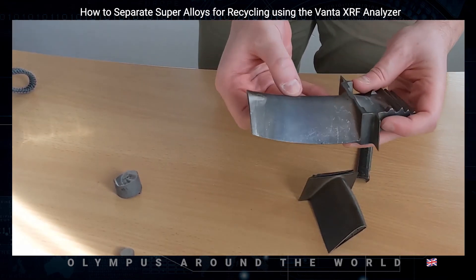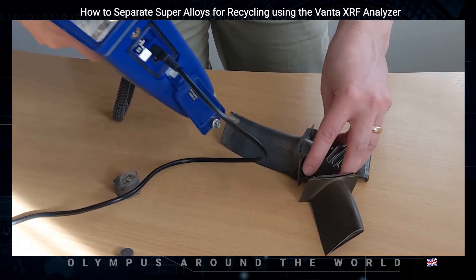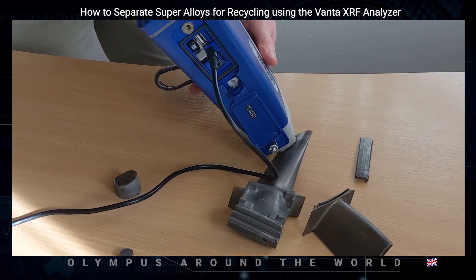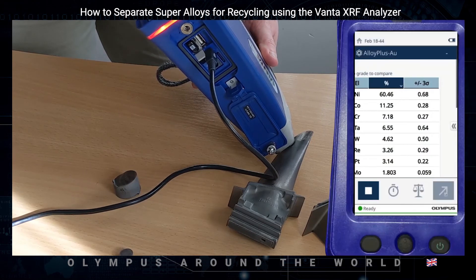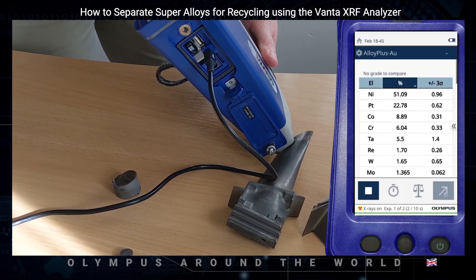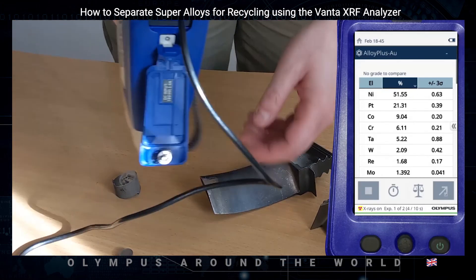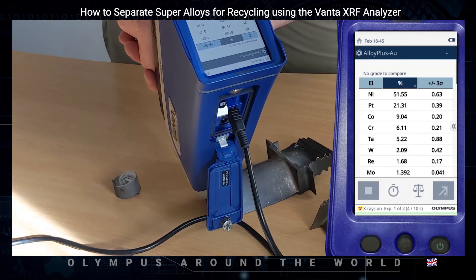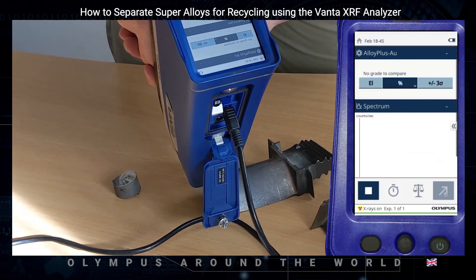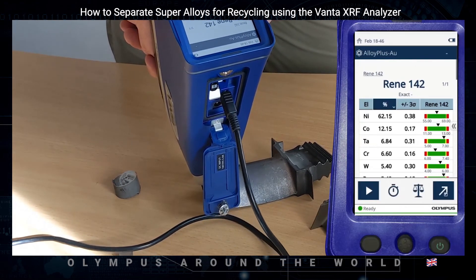As you can see on this turbine blade, the sample has been ground down at one point. If we test an area that has not been sample prepped first, you'll notice the chemistry doesn't give us a grade match and that the platinum level is really high — because this blade is platinum coated. If we test the area that's been ground off, however, you will see that we get a grade match that is an exact match for Rennie 142.